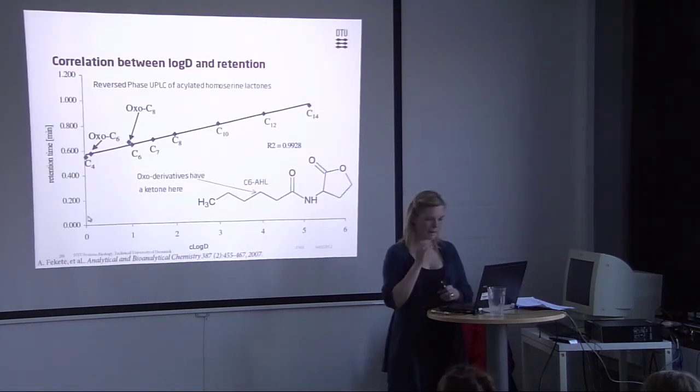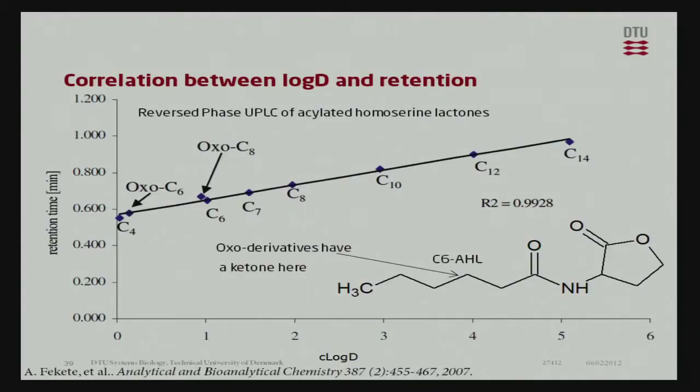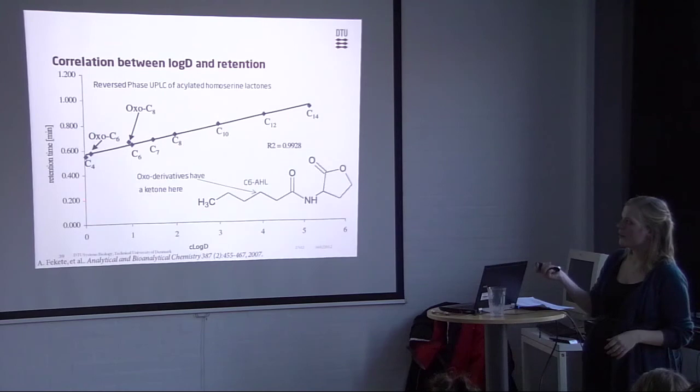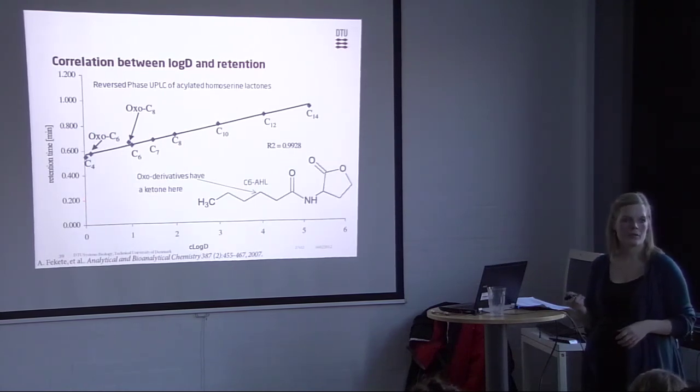So, like we talked about, we can predict these log D values. And log D predictions are good for prediction of retention time for some compounds. So here you got these homoserine lactones that you got on the TLC plate before. It's a beautiful linear relationship between retention time and log D value. So you see, the longer the chain gets, the higher the log D value, the more apolar the compound, the longer the compound will stick to a reverse phase column.